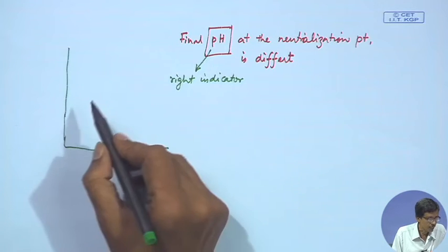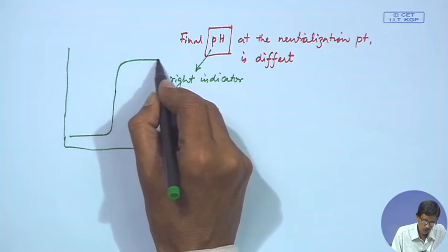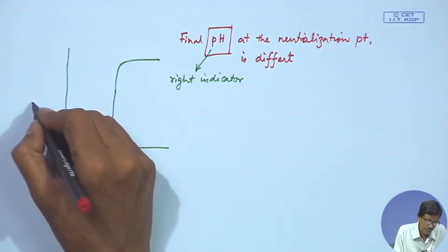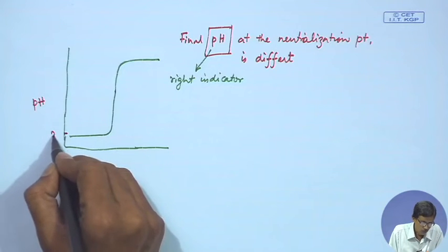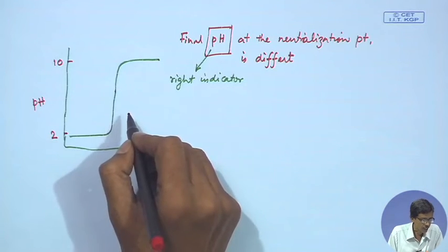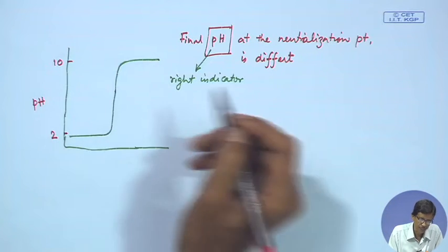What we know is the titration curve, if we follow it from a low value of pH to a high value, crossing that particular end point, we get this corresponding plot against pH, where pH starts from say 2, to 10, then 12 and 14. In this case we have a corresponding change in the color, when we have this steep rise in the titration curve.